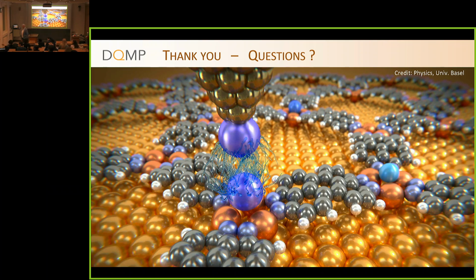I have one maybe very childish question about the tip. You're always talking about the very last atom. But is it possible that something sticks to the material? Oh, this happens. When you have an unstable condition, you can see it in the scan, it's changing. Usually we cannot know, but this is one possibility.